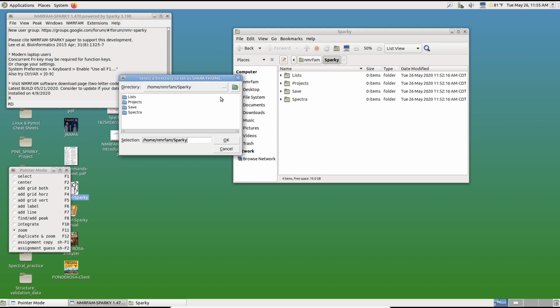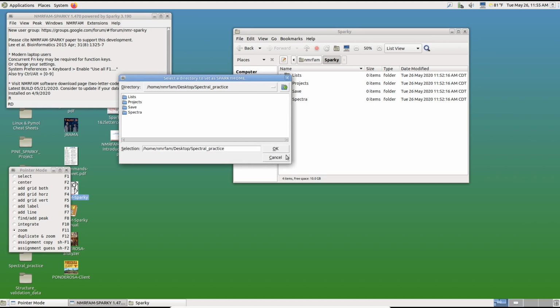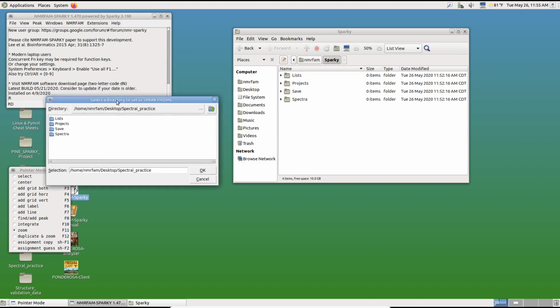Like it was instructed in the presentation, we will go to desktop, home NMRFAM desktop, and spectral practice. Don't go to the other subdirectory inside, just keep your place in this window in spectral practice and say OK.